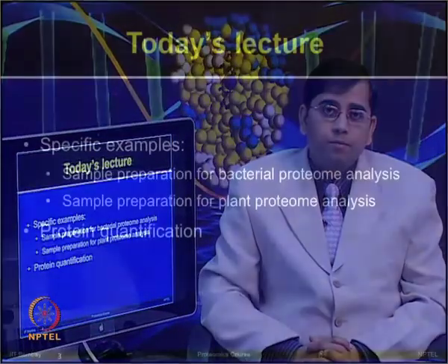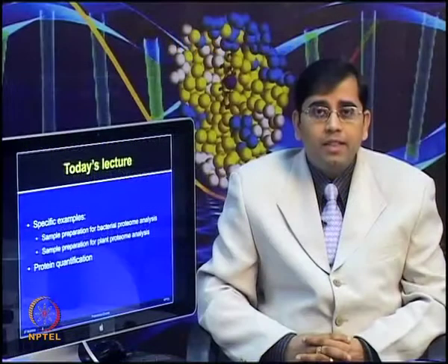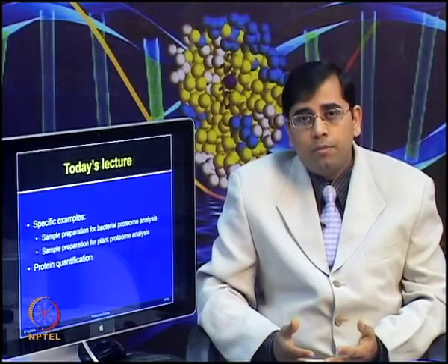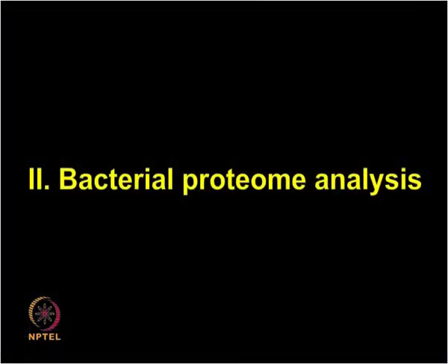In today's lecture, we will first talk about different types of methods available for bacterial protein extraction. I will recommend one method and elaborate on that. Then we will talk about how to prepare good samples for plant proteome analysis. We will then talk about how to quantify the proteins accurately, so that you are ready to perform proteome experiments. Okay, so, let us start with the bacterial proteome analysis.